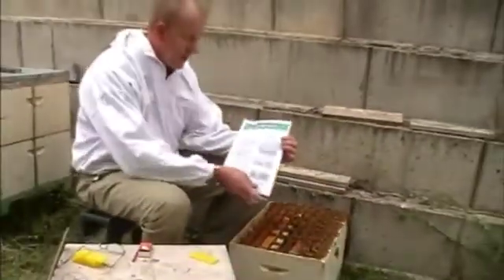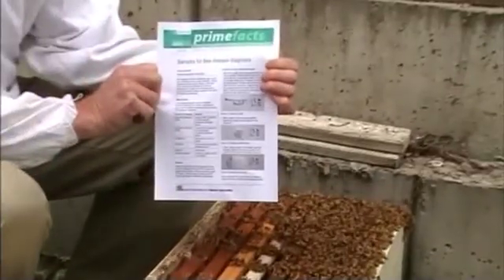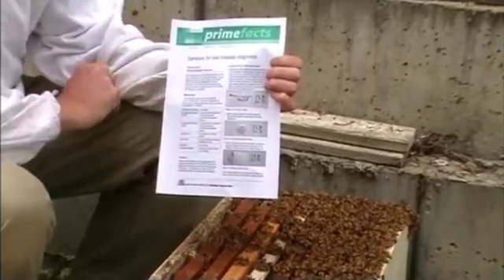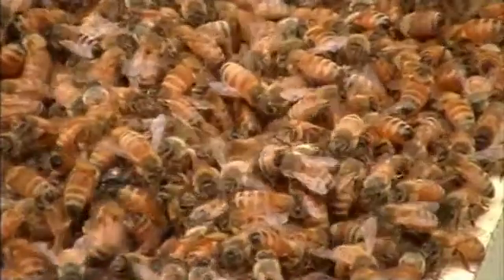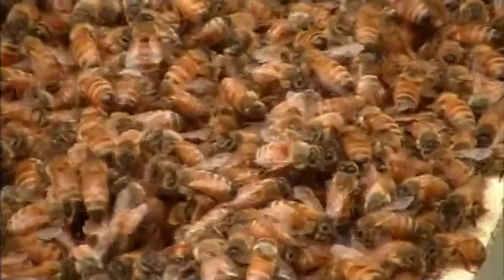Make sure you date it and sign it when you're sending that request. Do you only put diseased larvae on the slides, or do you try and get some from each of your hives just to see if it's spread? No — you want diseased larvae, because you can have an apiary of several hives or even a couple of hundred hives, and if one hive's got the disease, another one next to it may not. So there's no point putting larvae from several hives on the one slide. That slide is applicable to that hive and you need to treat it as a separate animal. Each hive is a separate animal.